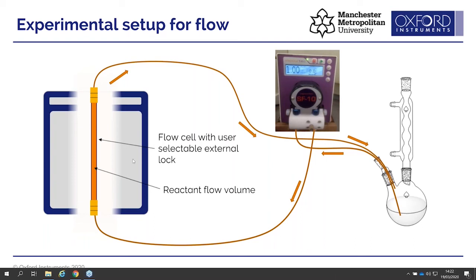The liquid and the reaction mixture that we're looking at is going down the center line here and we're pushing that upwards. So mechanically that means that if there's any air in that system, we can push it upwards and outwards away from the system, and that prevents any airlocks in the system, which can lead to inhomogeneity in the actual NMR spectrum, which is what James talked to you about in the first part. That liquid then gets returned once it's come out of the flow cell and back into the reaction vessel. And we're going to constantly flow that liquid round at a set flow rate, and can continuously look at it using radio frequency signals so that we can generate our spectrum.